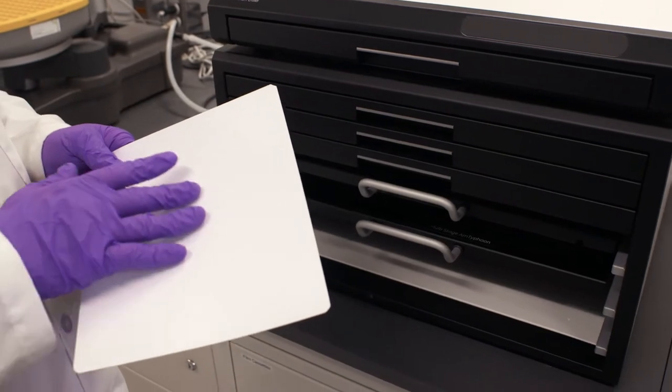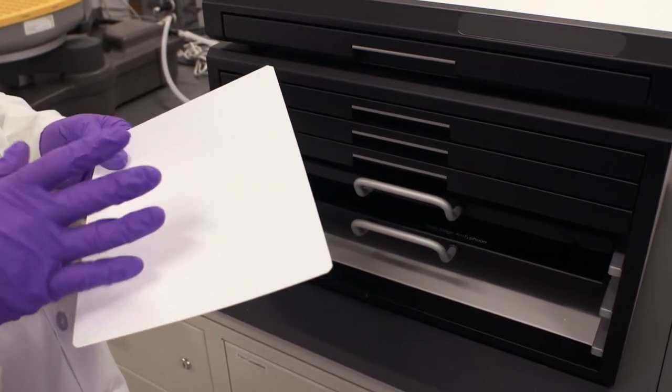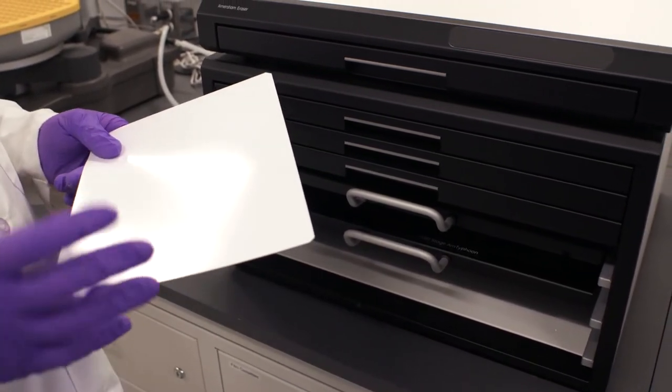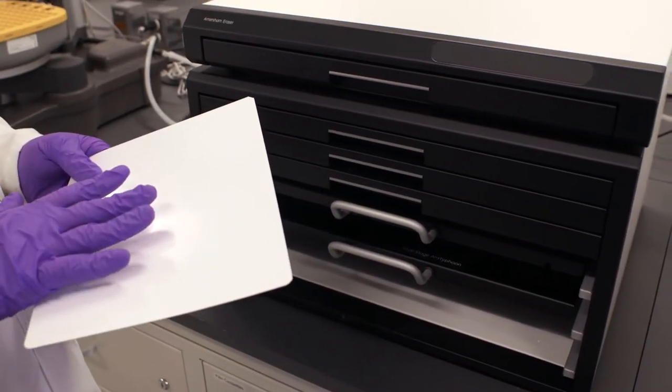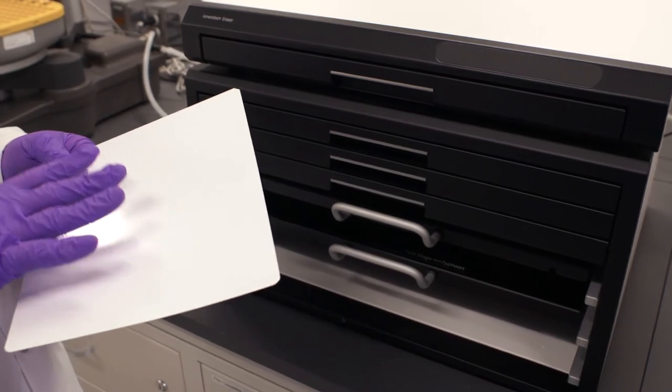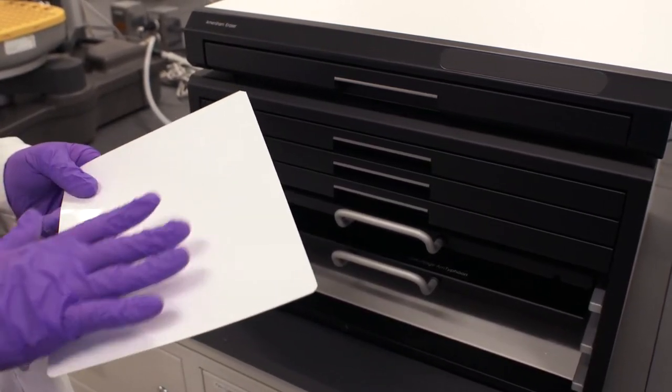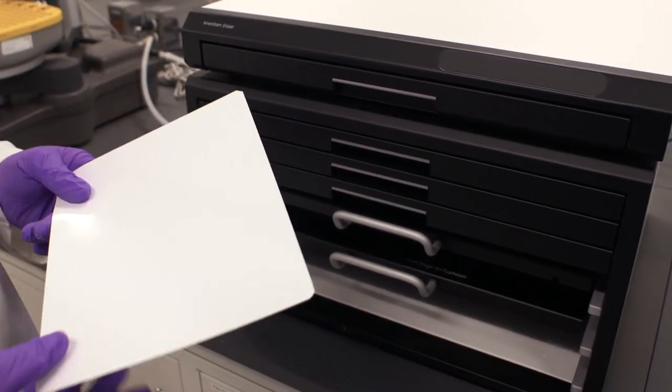It's very important we do that to do a fresh erase immediately before exposure because over time you can have cosmic radiation building up background in these screens. So we want to make sure it's as clean as possible before we use it.